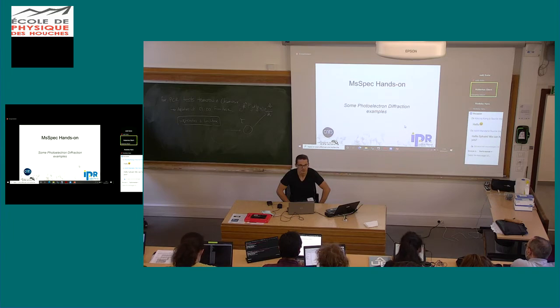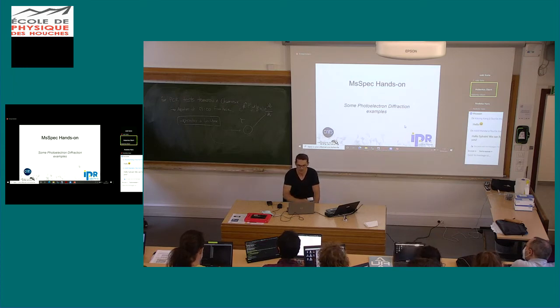A spectroscopy that is really close to the photoelectron diffraction is the Auger electron diffraction. It will also be available in a few months. But anyway, all the parameters or techniques that you will use today are transposable to every kind of spectroscopy. This is the same methodology, whether you are using photoelectron diffraction, Auger electron diffraction, LEED, EXAFS, etc. So you can map what you learned today to other spectroscopies.